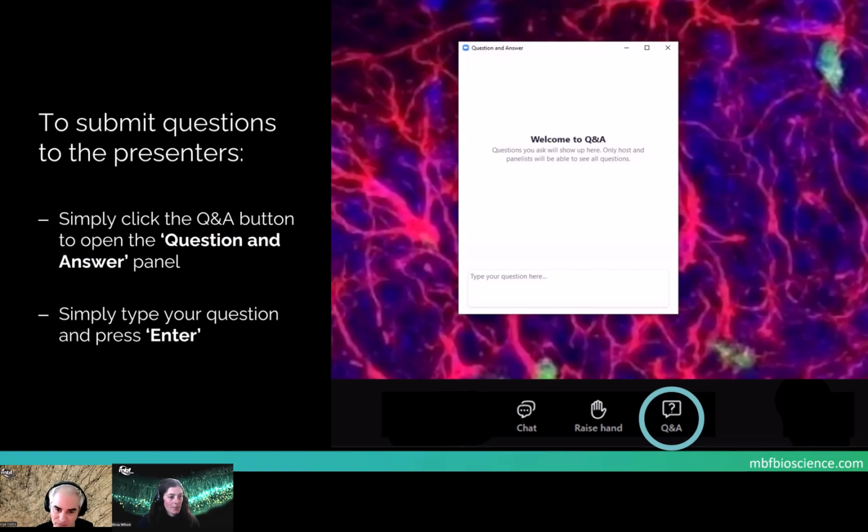There are definitely some changes necessary to be able to detect cells in bright field, primarily the fact that it's a composite of 3 channels, and Stereo Investigator right now is only using one channel for detection. So there is more information, and additionally probably the mix of these 3 channels actually provides color information. It's already giving more features for this classifier to analyze. So most likely we'll need classifiers for bright field and the fluorescent version of the same cell type. So maybe for people interested in NeuN for bright field, and then maybe NeuroTrace for fluorescence.